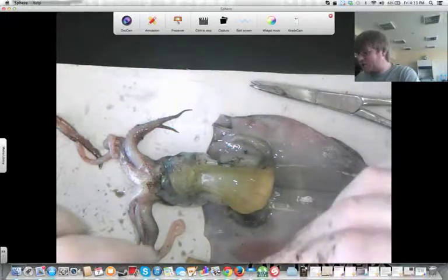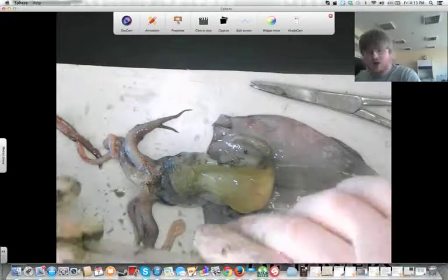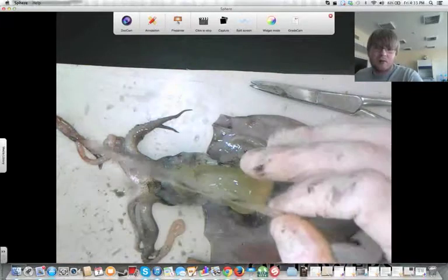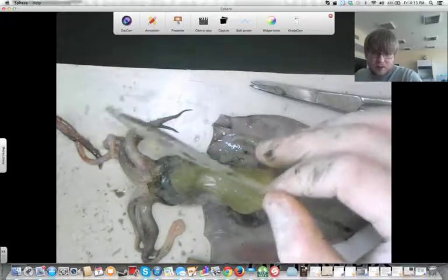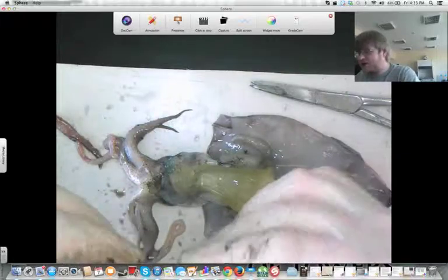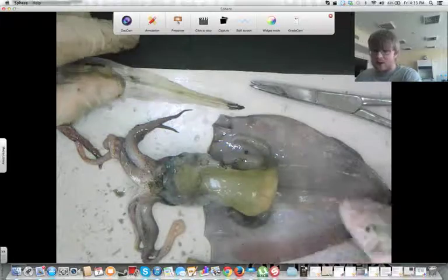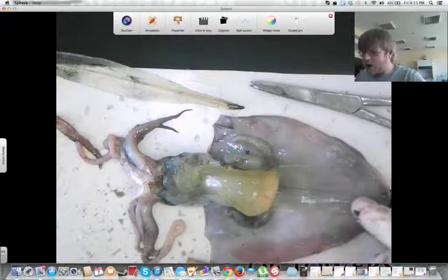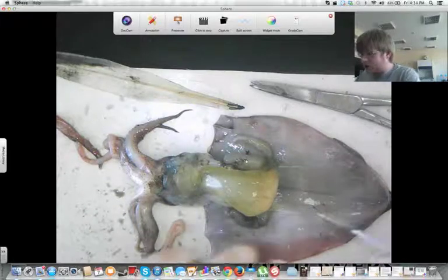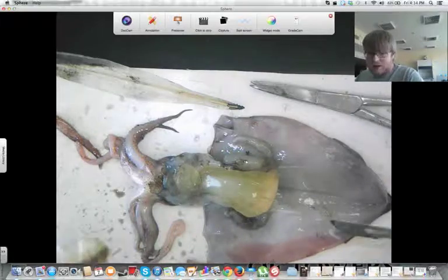Now, my pen has actually been out of the squid for several minutes, so it's dried out and become a bit brittle. When you take it out, it should be flexible and a little bit soft, but please don't twist it around and stuff. It will break very easily, and I do want you to keep these intact for a little bit longer. You may need to use the scalpel to cut away at the sides of the pen in order to remove some of the tissue and take it. That's okay, just make sure you don't cut away the entire way. Just cut gently, and the connective tissue cuts very easily.